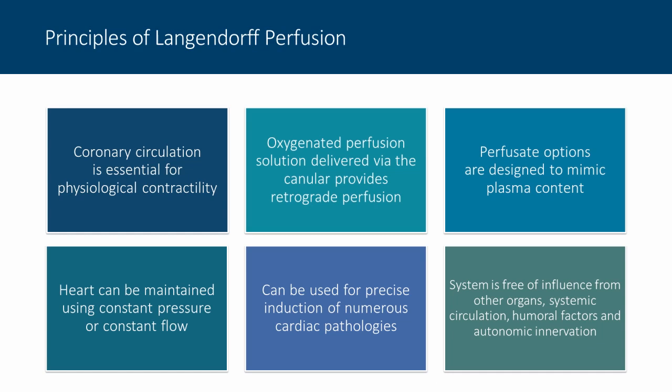And for most, if not all scientific applications, there are obviously limitations, and I will try to address some of these shortly. However, the Langendorff system is an incredibly well-studied system, and it is well accepted in the field of cardiovascular basic science as a way to investigate numerous cardiac pathologies in a really precise manner, including myocardial ischemia, ischemia-reperfusion injury, hypoxia, and also pharmacological interventions.